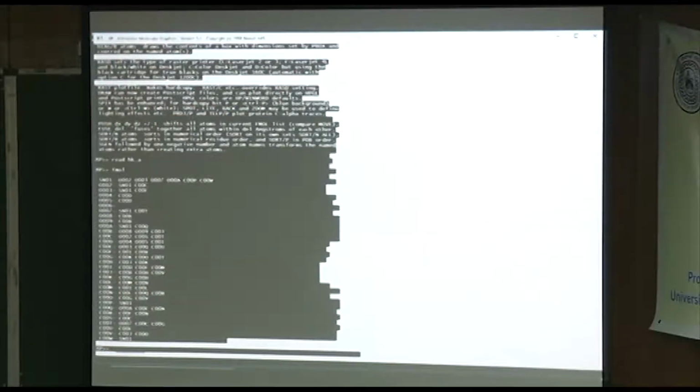So it looks like this. This atom numbering scheme is not my favorite. Everything is, of course, 4 characters, like everything that SHELX has. But it has all these extra zeros and everything. Now, if you want to see what it looks like, you could just say proj, short for project.